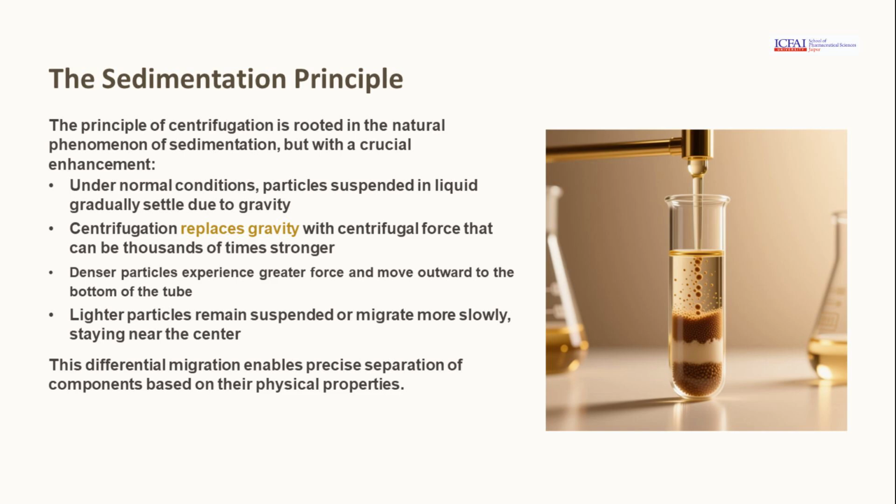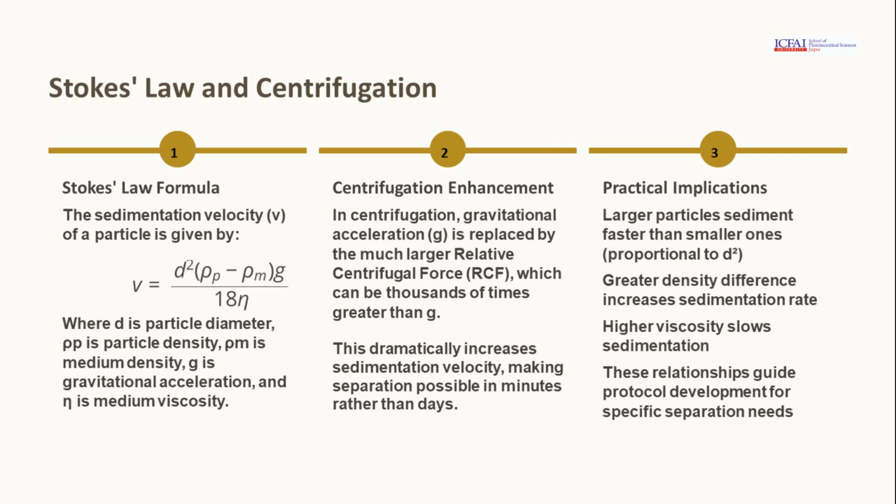Under normal conditions, particles suspended in liquid gradually settle due to gravity. Centrifugation replaces gravity with centrifugal force, which can be thousands of times stronger, enabling precise separation of components based on their physical properties. Stokes' law provides a formula for the sedimentation velocity of a particle, which is crucial in understanding centrifugation.